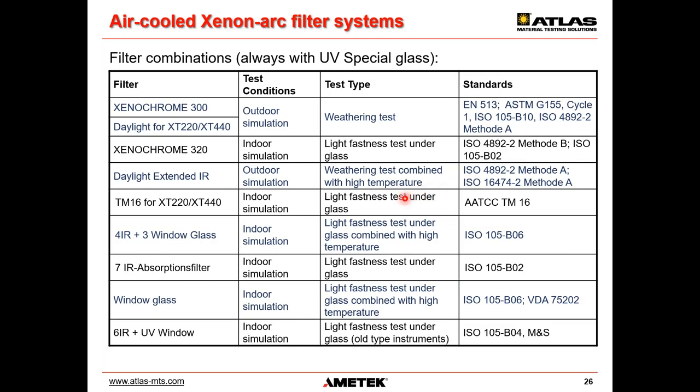The same is valid for air-cooled xenon instruments like the XenoTest. There are different types of optical filters, simply for historic reasons and historic standard reasons. And we're currently working on releasing a Right Light filter for our XenoTest instruments, which is probably coming soon.